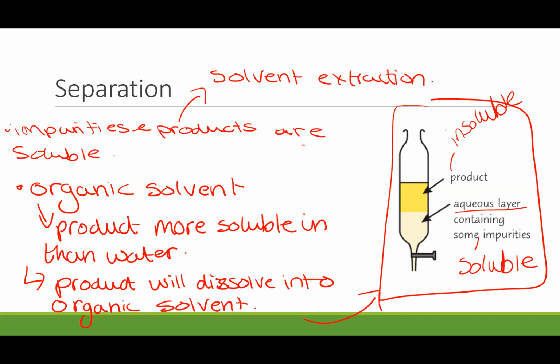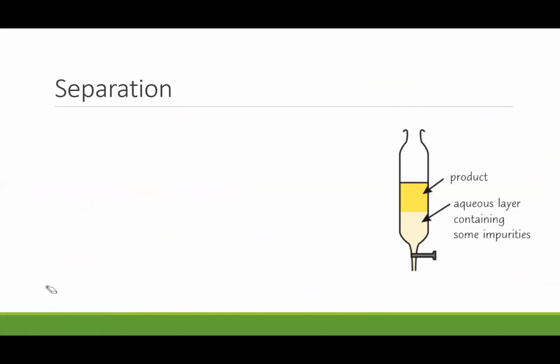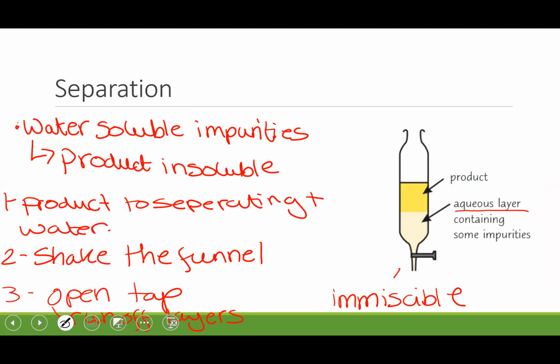If we're using this method, we have some issues with it though. So when we need to remove water from the purified product, because what's going to happen is if we're using separation to purify a product, our organic layer, so this product layer, is going to end up holding some trace amounts of water.